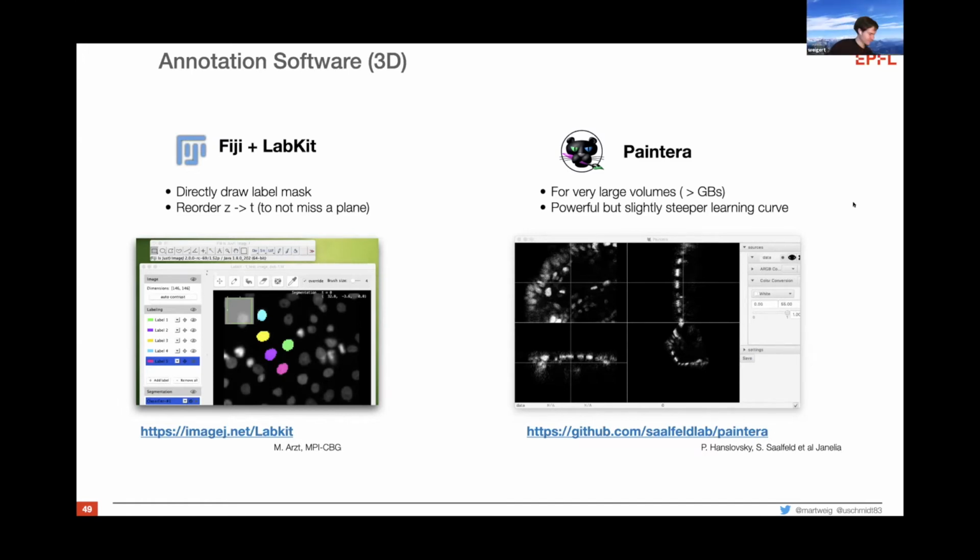Just use TrackMate, yeah. So it really depends on the data. Probably the greedy approach works beautifully and you get around the painful 3D annotation. But since this wasn't a clear-cut, obvious thing to do, and it depends on the data, it might fail. That's why we haven't done anything with it, and also due to lack of time. But that doesn't mean it's not a good idea. Actually, I think it's a very good idea, but we haven't implemented it in a straightforward way to use. Yeah, you would have to find your way around it on the Python level, which would be interesting.